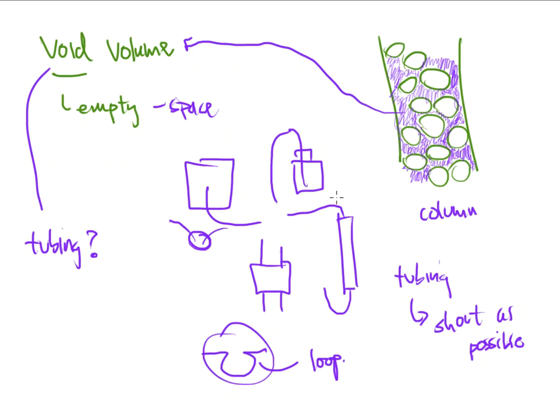The reason that I'm talking about void volume is because the void volume is going to lead to band broadening. And you do not want that to happen. You don't want fat peaks. You want super narrow ones.